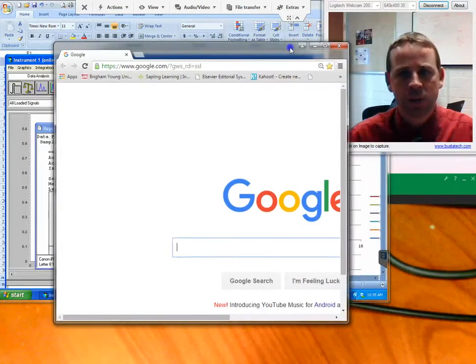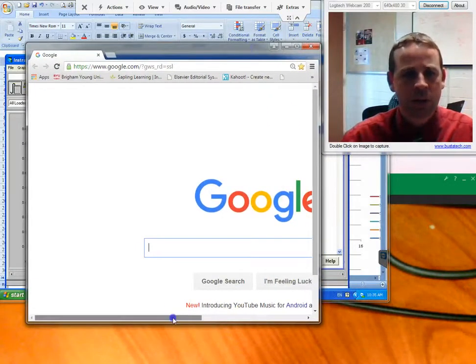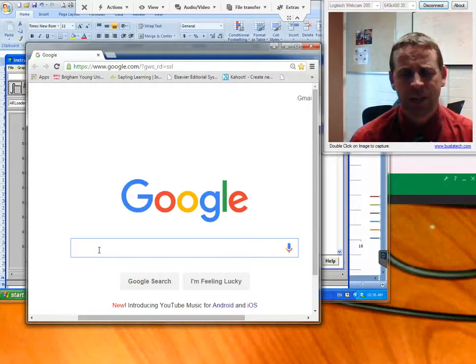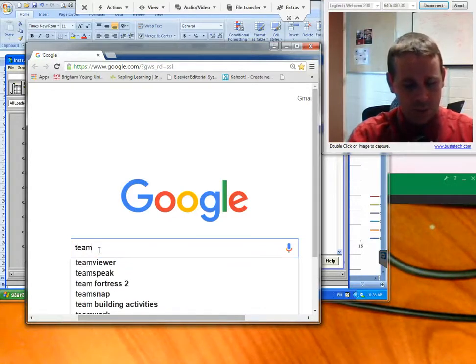Alright, so this video is going to teach you how to access and analyze data from the HPLC. The first thing we're going to do is go to the software, from your home computer or wherever you are, that will allow you access to the HPLC's computer, because we're just going to analyze the data. The software we're going to look at is called TeamViewer.